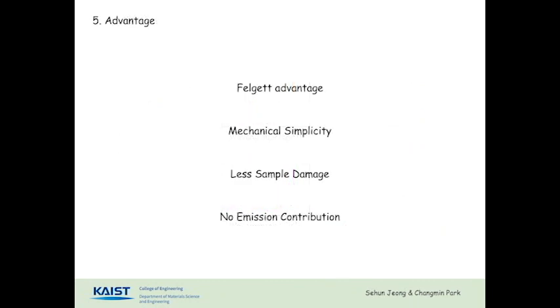Advantage: and last, there are advantages of FTIR. As the last graph shows, FTIR collects data over a wide spectral range, but it takes less time, so it's easy to measure repeatedly. The moving part is only one moving mirror. There is less wear and high reliability.